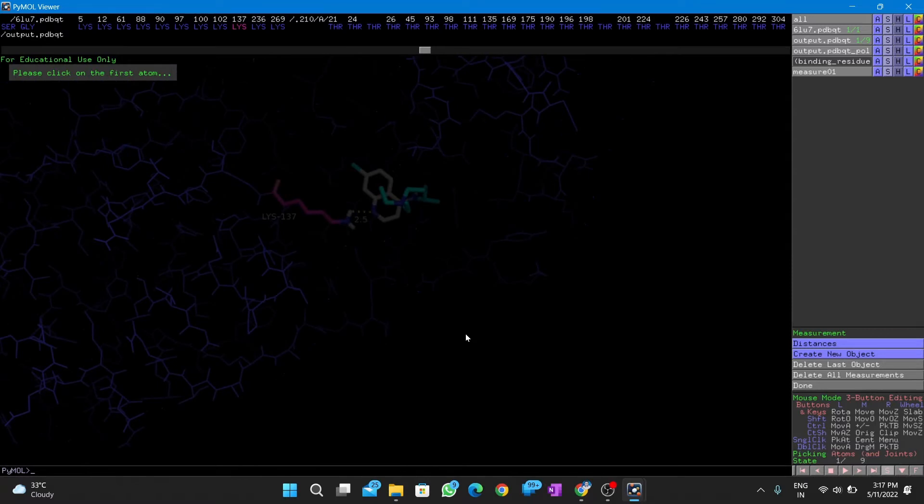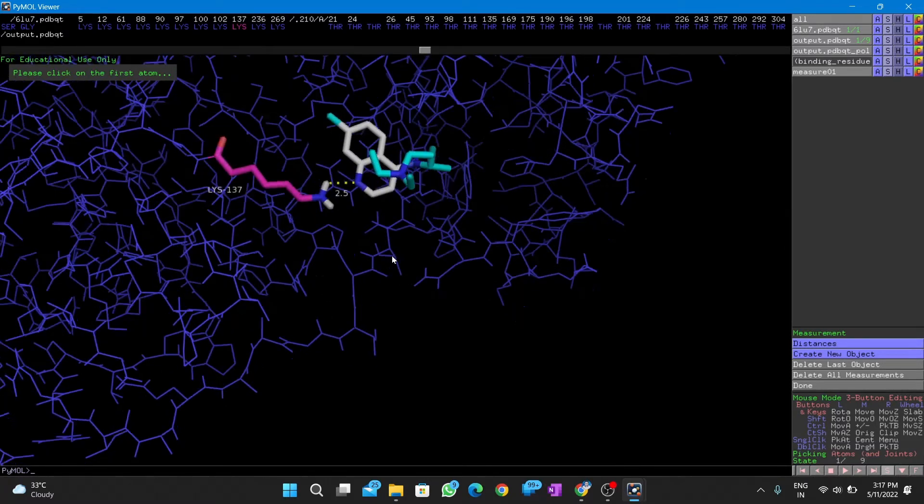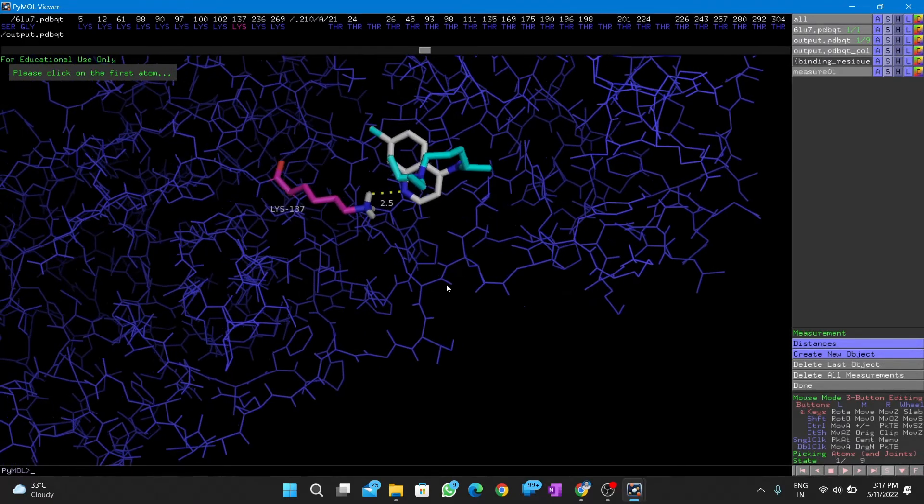We can display the surface model of the receptor for better understanding of the binding pocket.